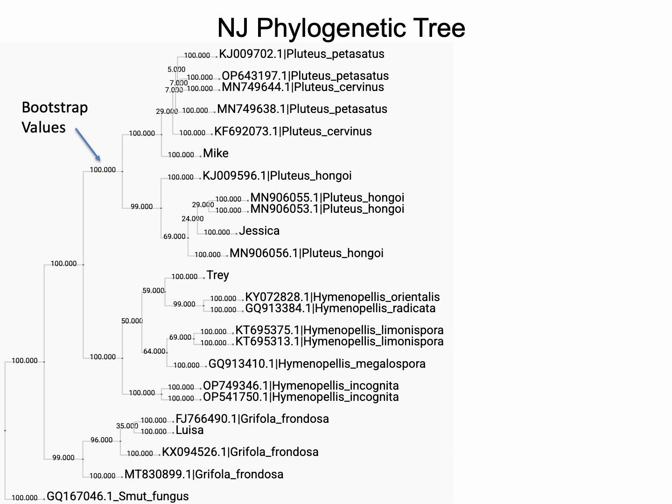The neighbor joining algorithm builds a tree from the bottom up by comparing the evolutionary distance between pairs of DNA sequences. Sequences with best matching sequences are linked as neighbors that share common nodes in the tree. Because the branch distances are produced in a pairwise manner, neighbor joining does not optimize branch length and tree parsimony. The numbers you see on the tree typically represent bootstrap values. These values indicate the confidence level in a particular branch of the tree, reflecting how frequently, percentage-wise, that branch appears in multiple trees generated from resampling your dataset over and over again.